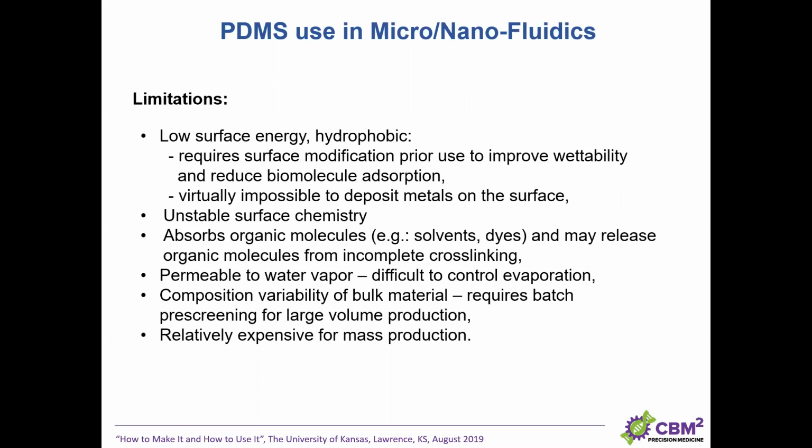It is really an engineering material with main application in many other industries, right? So the properties that this material was developed for were a little bit different than microfluidics. Some of the composition variability of bulk material may not be an issue for regular industrial application, but very often is an issue for microfluidics.